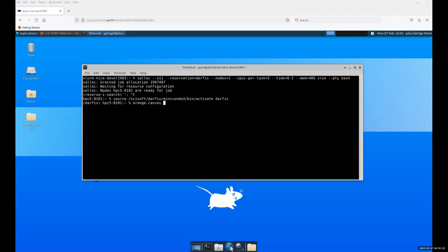But listen, I have solved the issue because I copied from the temporary directory the complete data set. So now I have it. Okay, that's good. If you manage to install it and you have the complete data set, then you're all set to go. Okay, good.